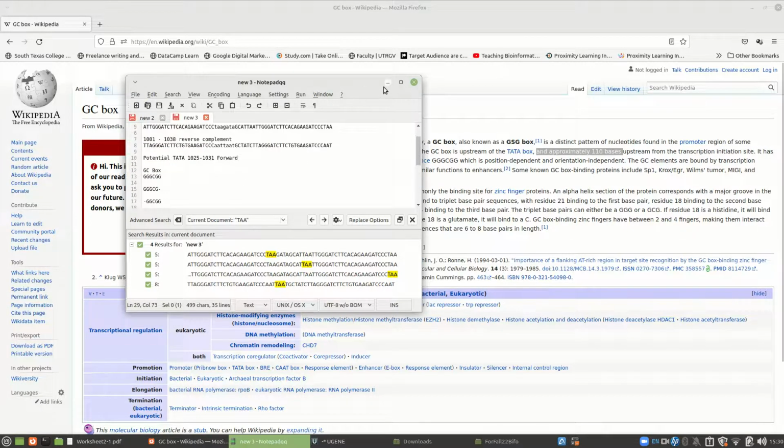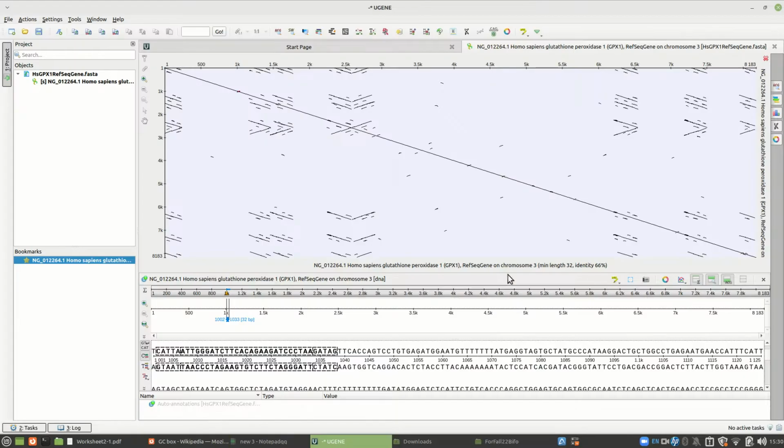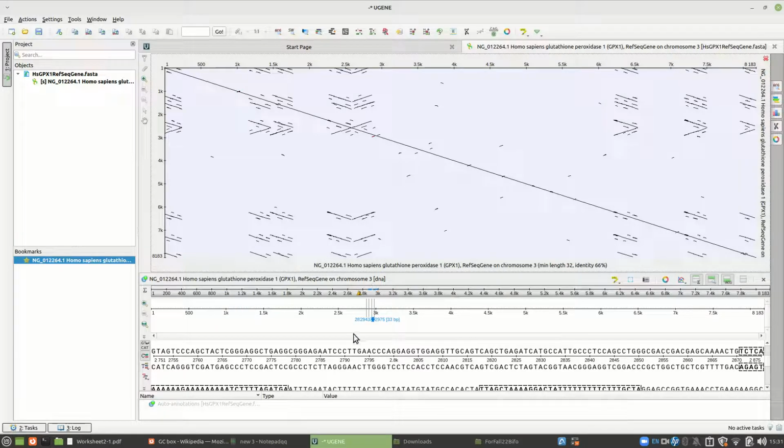All right, now let's go to one more thing before we end this video. Let's look at terminators. Let's see if we can find a place that would make for an interesting terminator. Now for you, it's going to be down here somewhere. Could be in this group, or it could be that little thing. I'm not going to give you any hints yet on that. Just take a look at some of those sequences. For me, I'm really thinking I should look right here. So I'm going to click on one of these, and I'm going to see what that looks like.